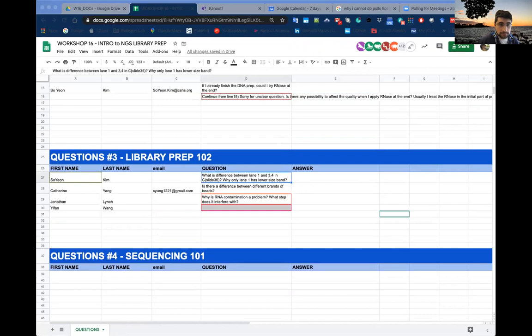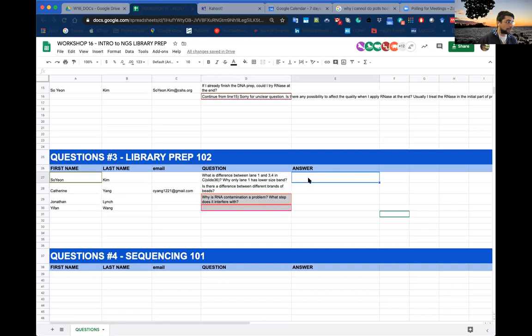All right, 36. Okay, so this was the slide of the final libraries. And what is the difference? The only difference is that there were three different types of library preparation. Basically different samples and three different types of library preparation. Okay.